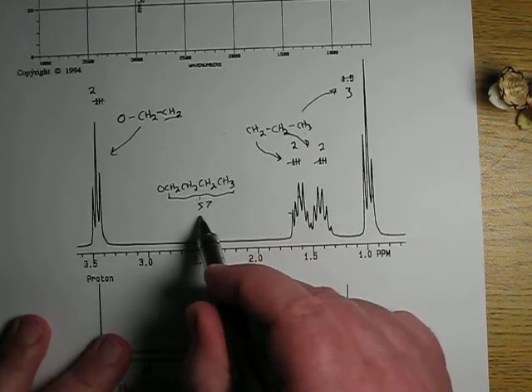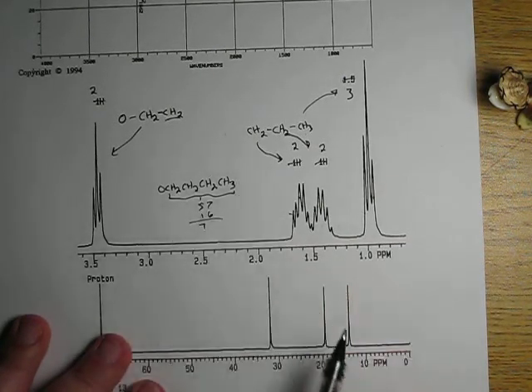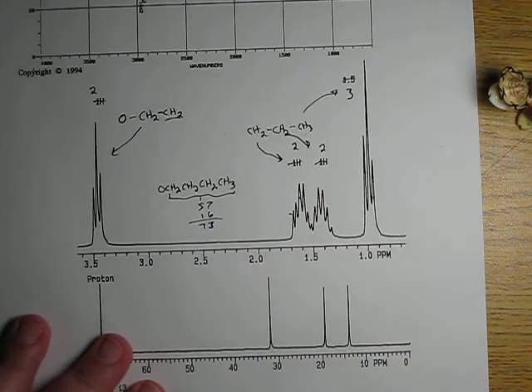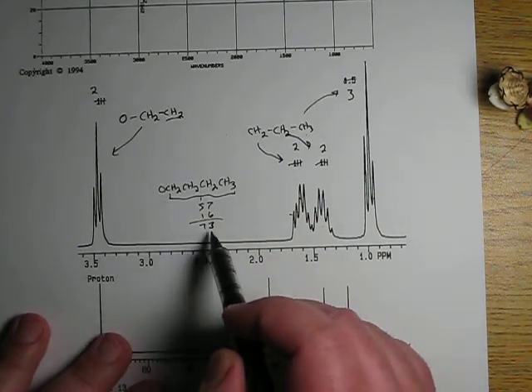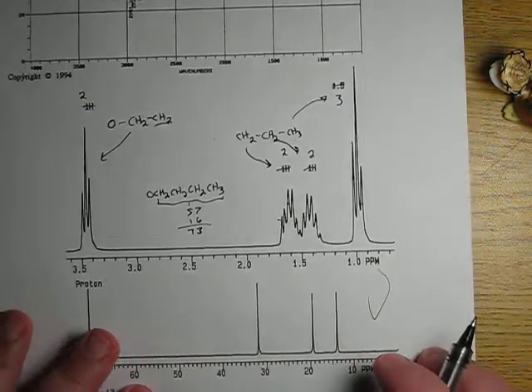Oxygen is 16, so 57 plus 16 is 73. All right, check my math there. I got 73 for this. Add that oxygen in there, we get 73. But I know my mass from up there is 130.